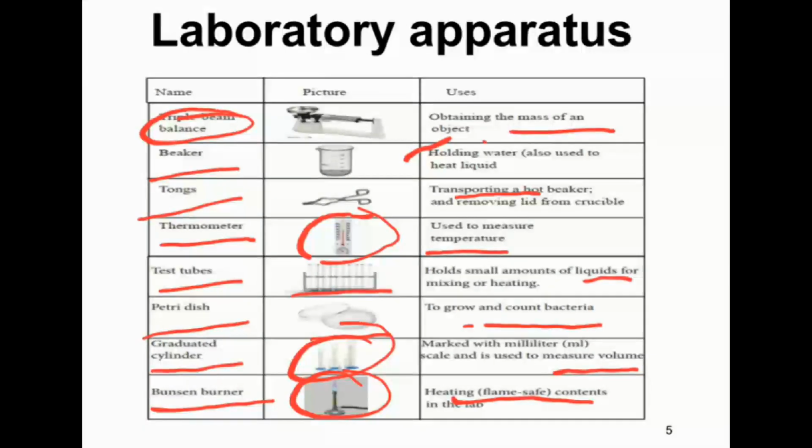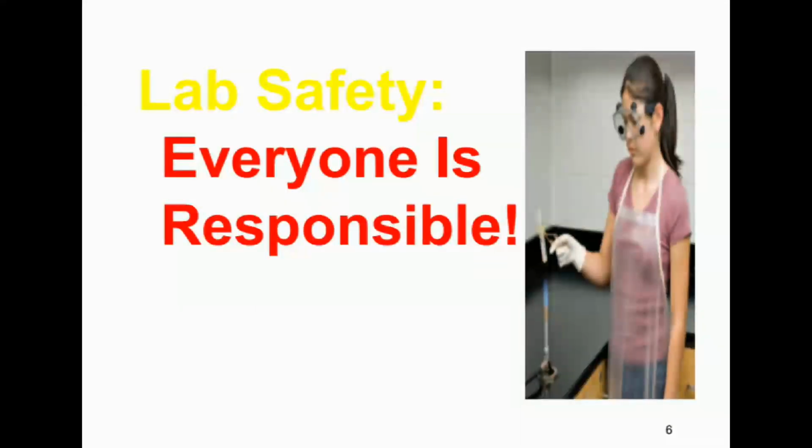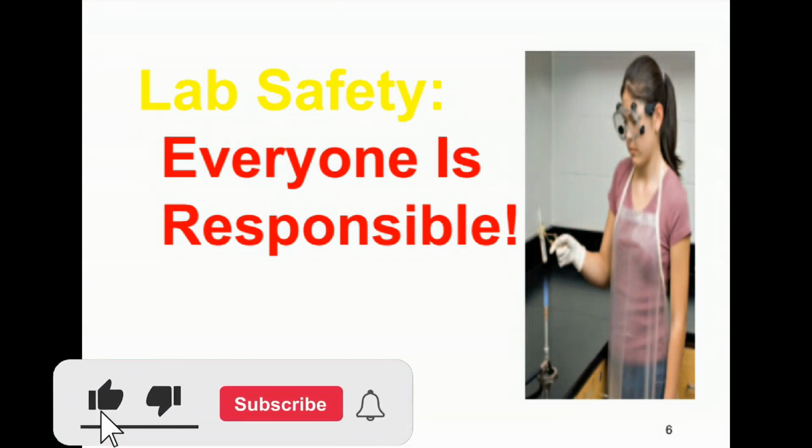these are the common laboratory apparatus so and you should be familiar with their use. So now let us see lab safety. So this is very important topic and you should remember that everyone is responsible.